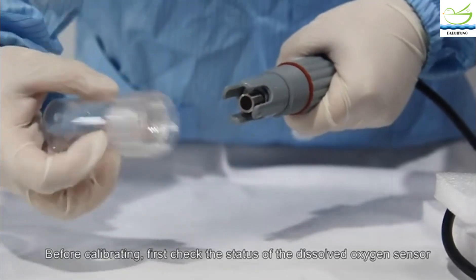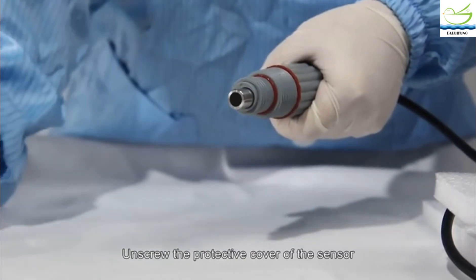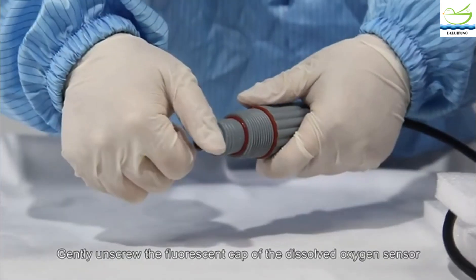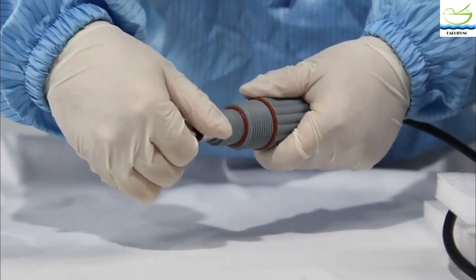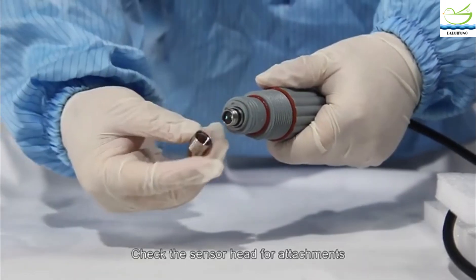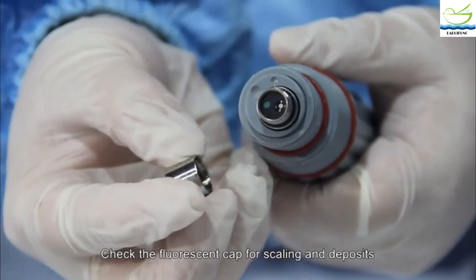Before calibrating, first check the status of the dissolved oxygen sensor. Unscrew the protective cover of the sensor, gently unscrew the fluorescent cap of the dissolved oxygen sensor. Check the sensor head for attachments and check the fluorescent cap for scaling and deposits.